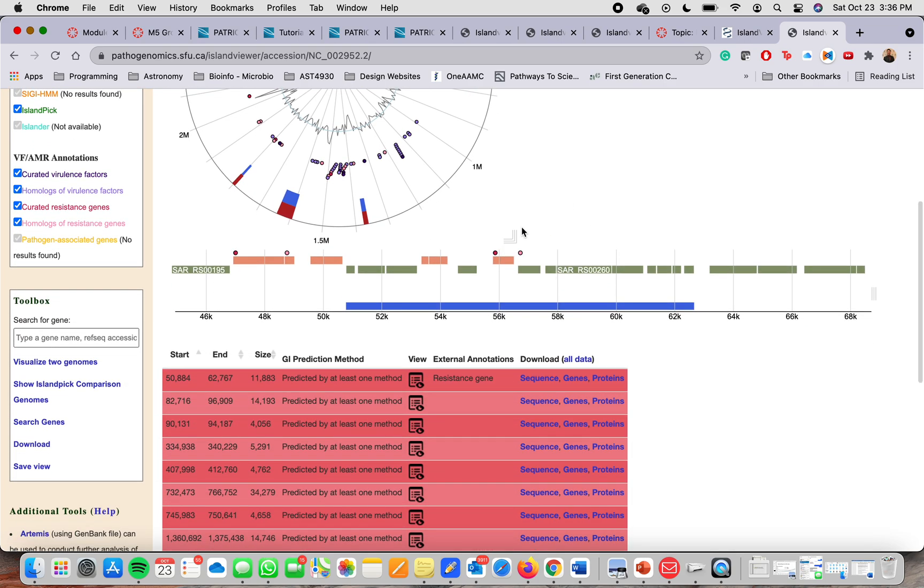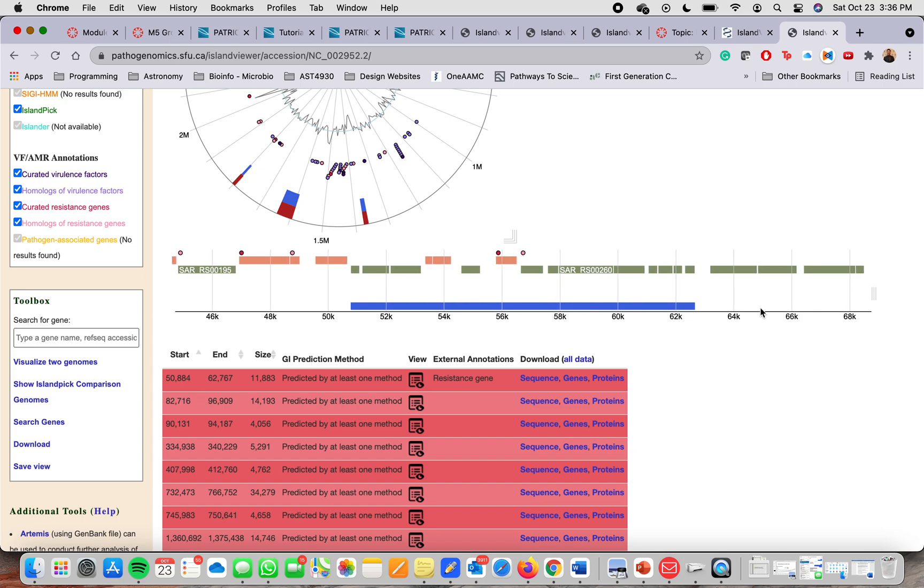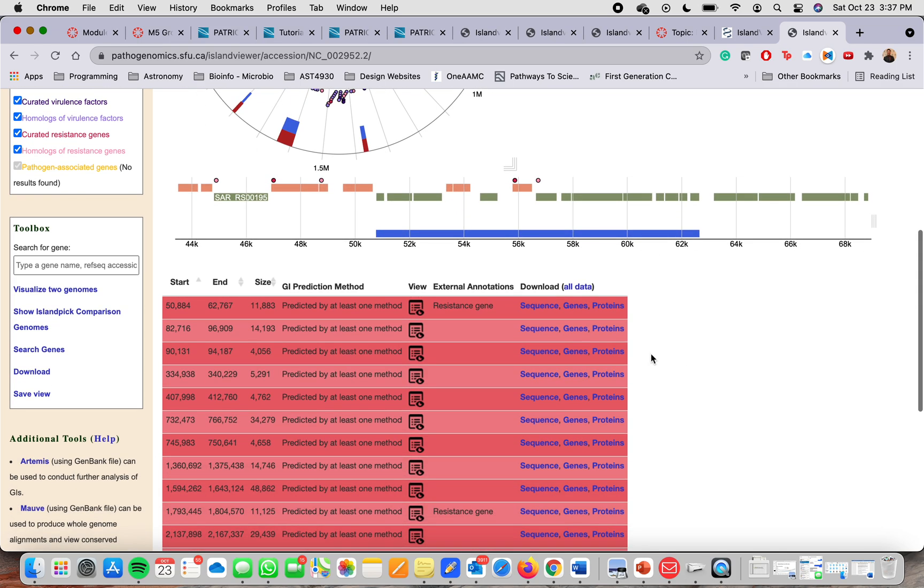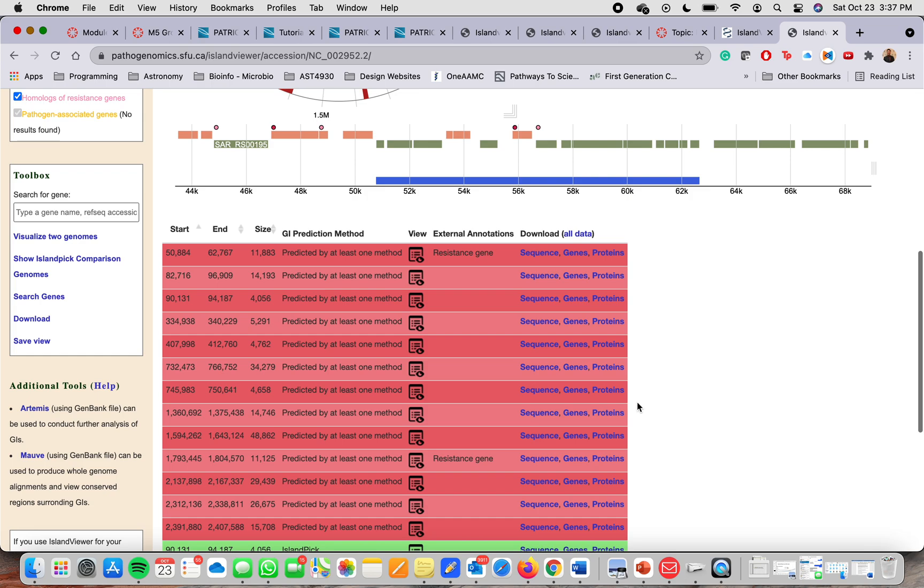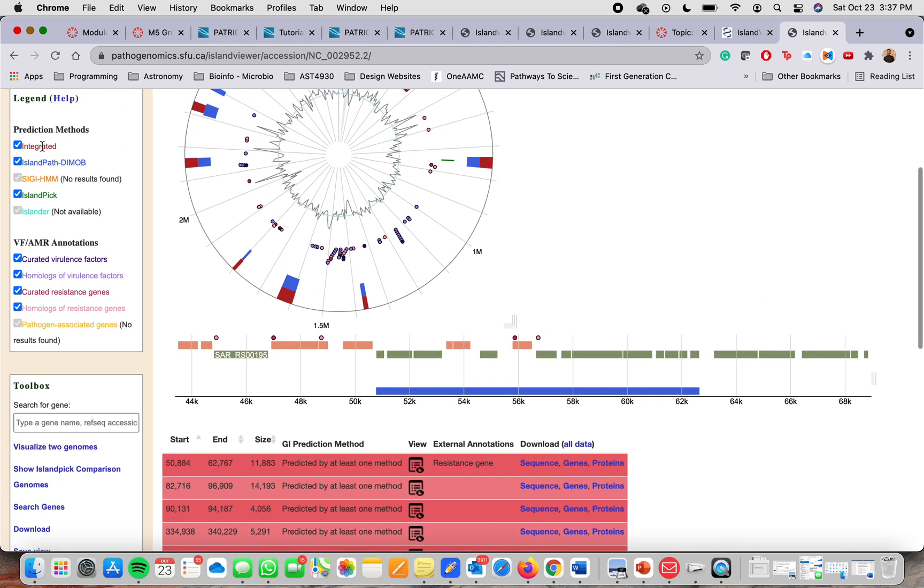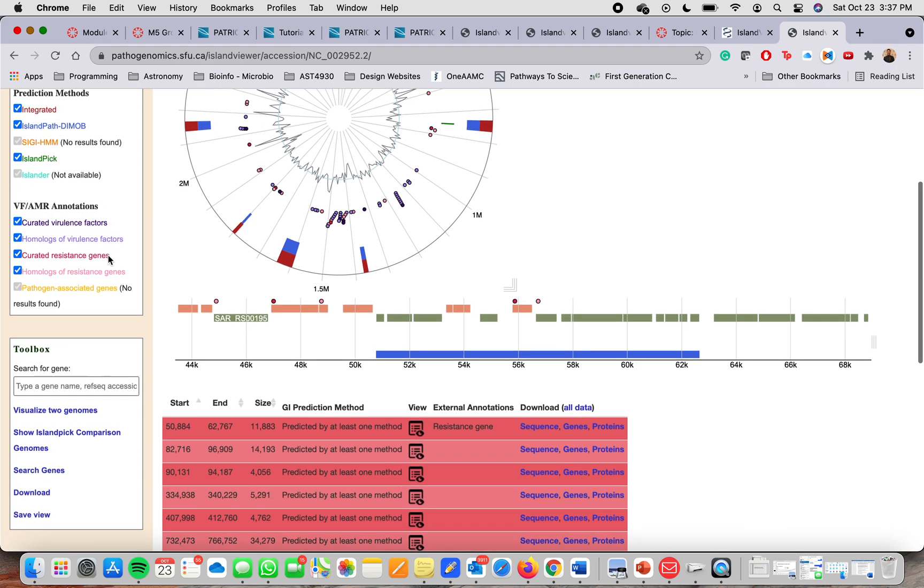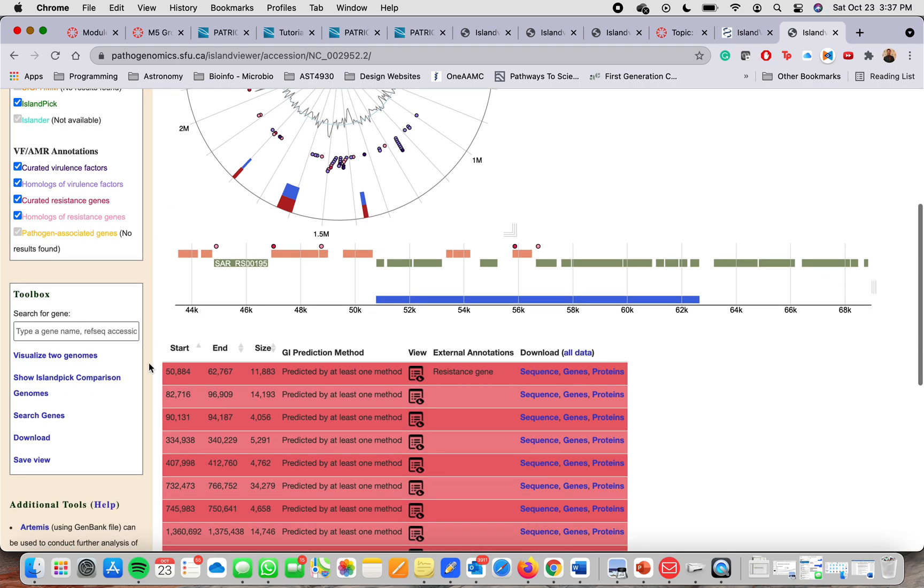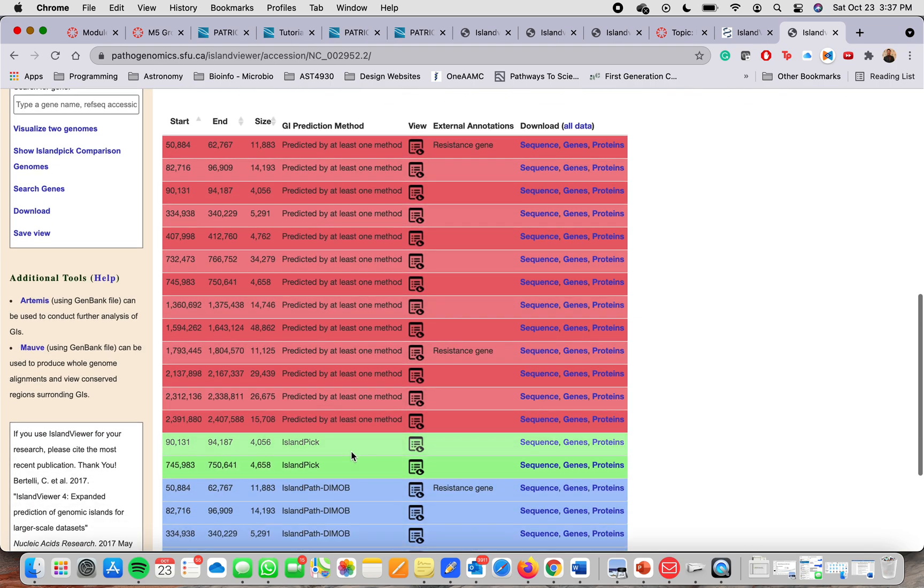You can exit that window. And if you scroll down, you'll see more information, like more detailed information, like the genomic island prediction method that was used. It is also color coded right here, integrated method for red and then blue for island path, as it follows there with the colors.